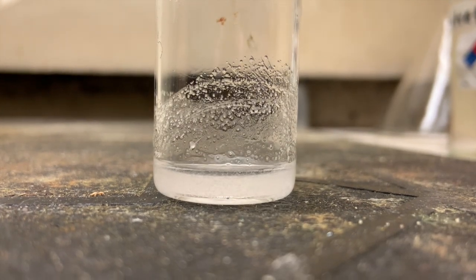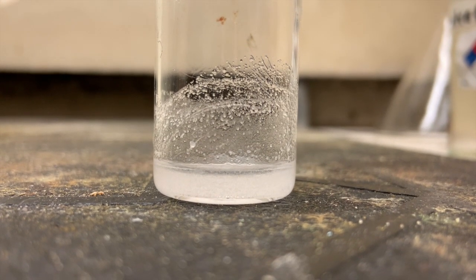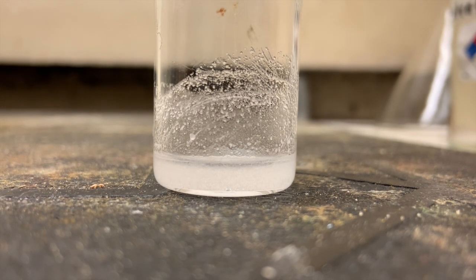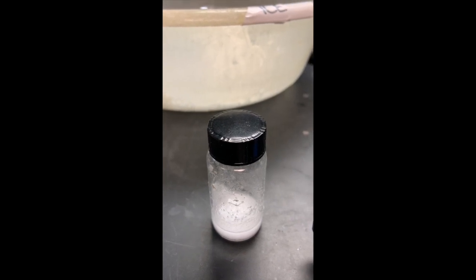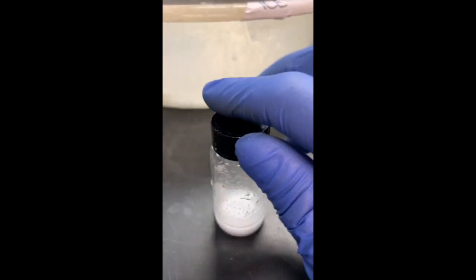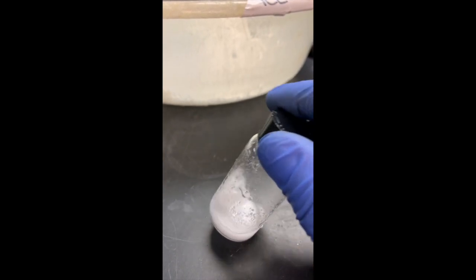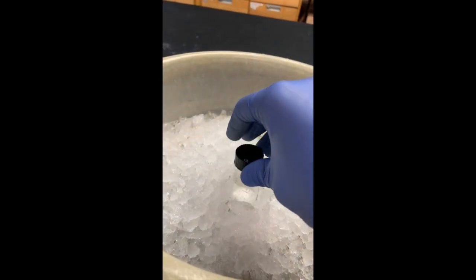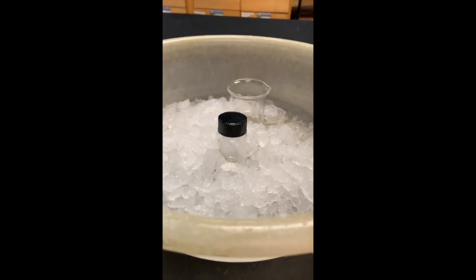So I'm going to let that sit for a minute, and then I'm going to take it over to my bench and add another 0.5 milliliter of water to my vial. Now I've added 1 milliliter total of water to my vial, and I see that there is some crystallization happening, which is great. I'm going to place the vial into an ice bath and let it sit for 10 minutes before I vacuum filter it.